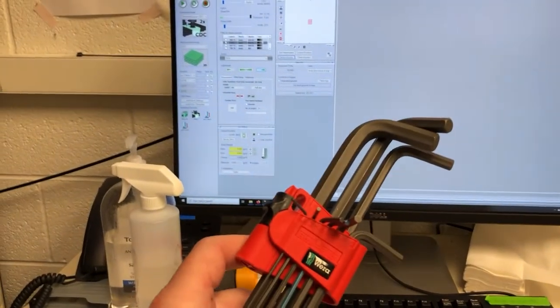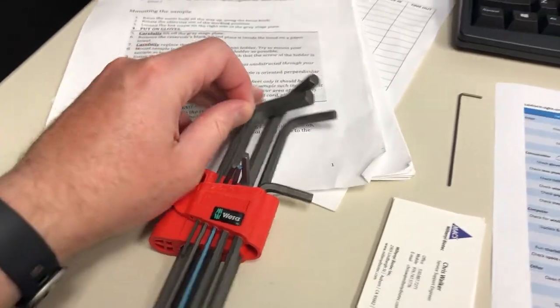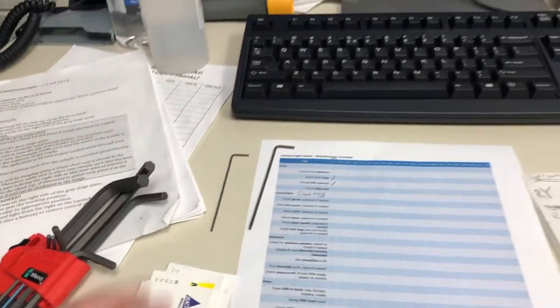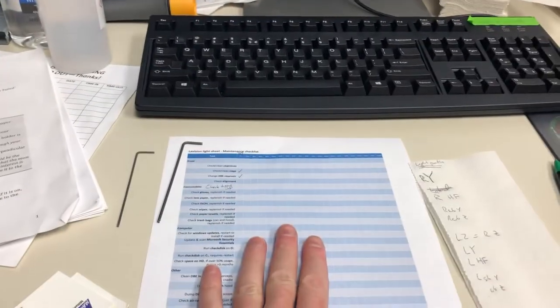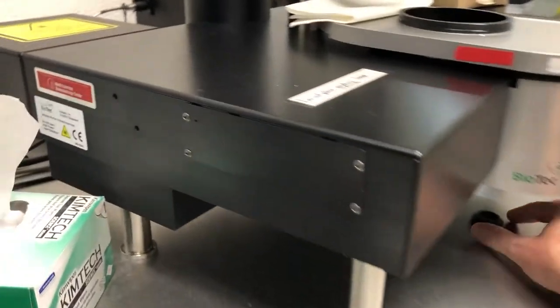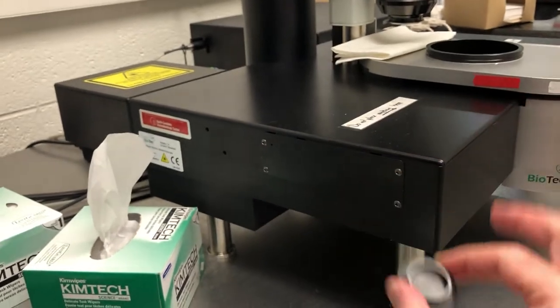We will need this set of Allen wrenches, specifically the 1.5 and the 2 millimeter. We also need these cards to block some of the sheets. I always keep my maintenance checklist on hand. You will also need this container, because this is where we're going to put some of the screws that we remove.